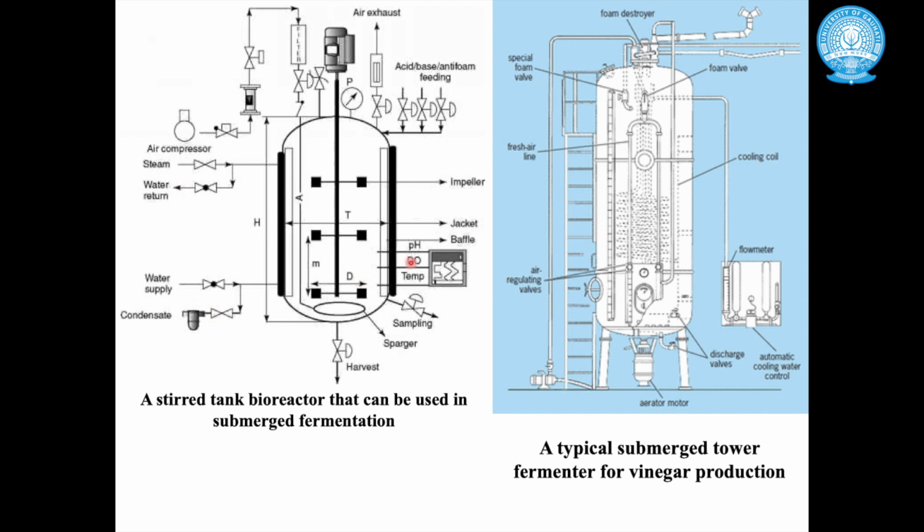How do you measure the pH, how do you monitor the pH, the dissolved oxygen, how is it important to the growth of the microorganism, the temperature, how it has to be maintained. So these are important attributes of fermentation. What are they? They are the pH, dissolved oxygen, temperature, acid base balance, foam, formation of foam and use of anti-foam reagent, exhaust air, and the kind of air that is let in, and the amount of sterilized medium that is let in.